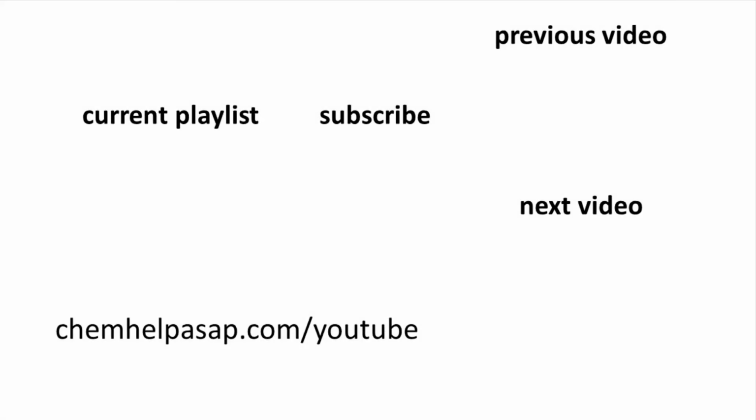I hope you enjoyed this reaction, which involves the conversion of a cyclic anhydride into a cyclic imide, and is also an API in an approved drug.